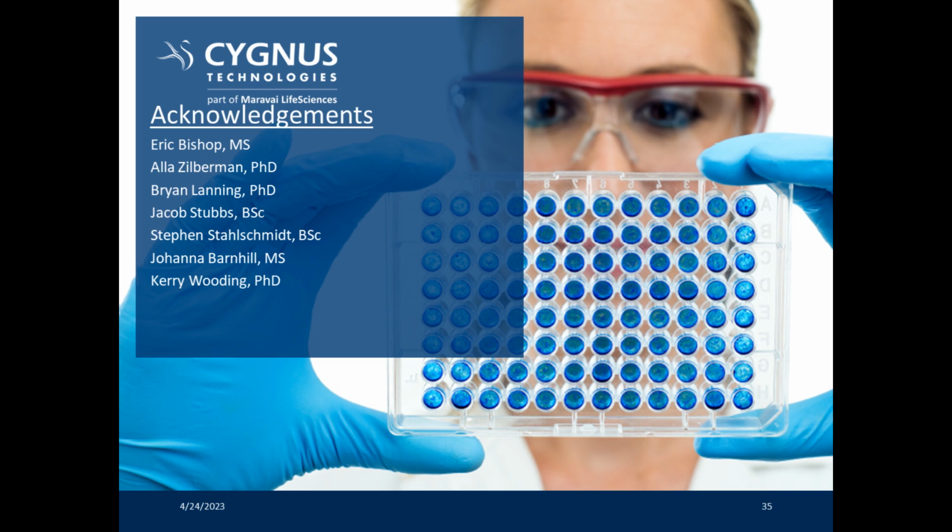Okay, great. And as a reminder to our audience, you can go ahead and type in your questions for our speaker now. So our first question is, what is the sample volume requirement for coverage analysis by AAE with 2D PAGE and AAE-MS? Oh yeah, this is a good question. We get it quite commonly. So for 2D PAGE and MS, if you submit a harvest sample, we typically like a sample volume of 20 to 40 milliliters. For drug substances, this is typically at least 50 milliliters.